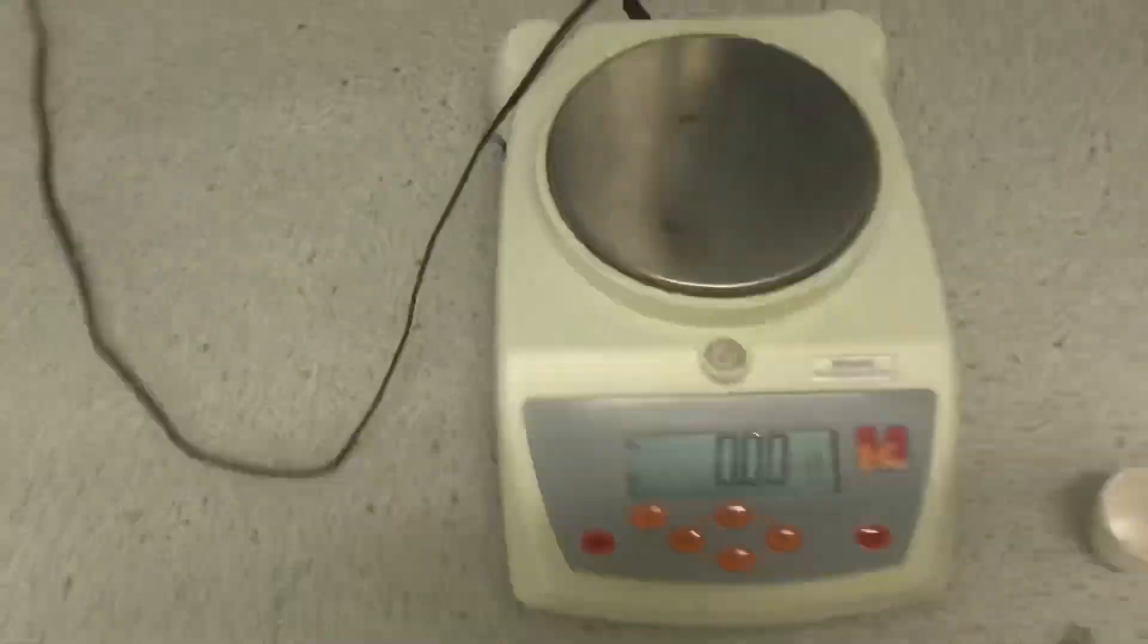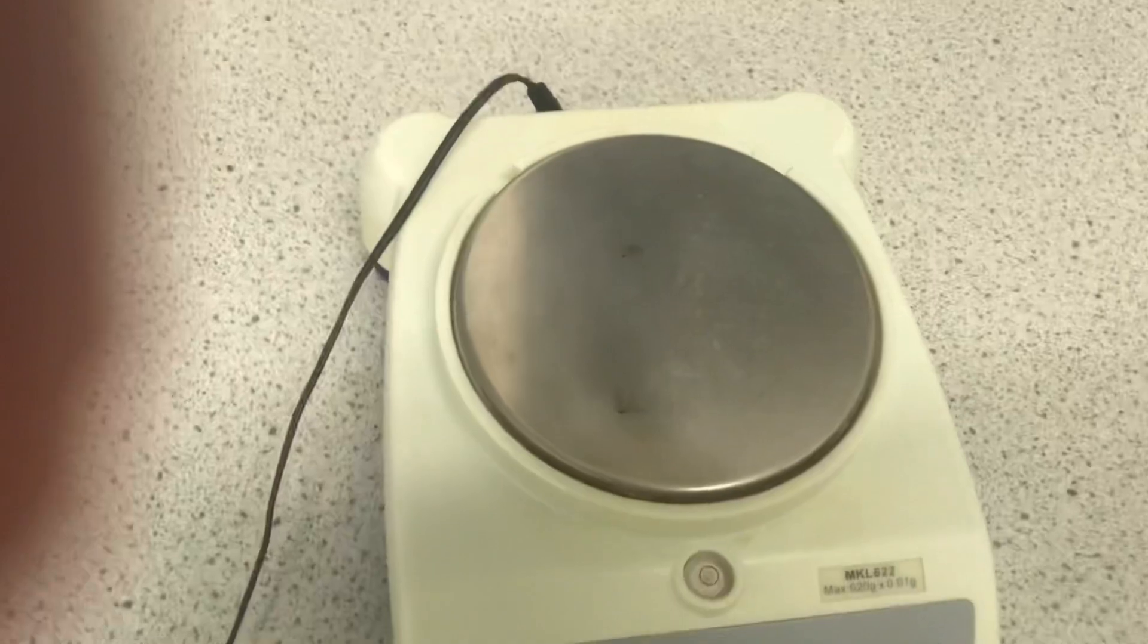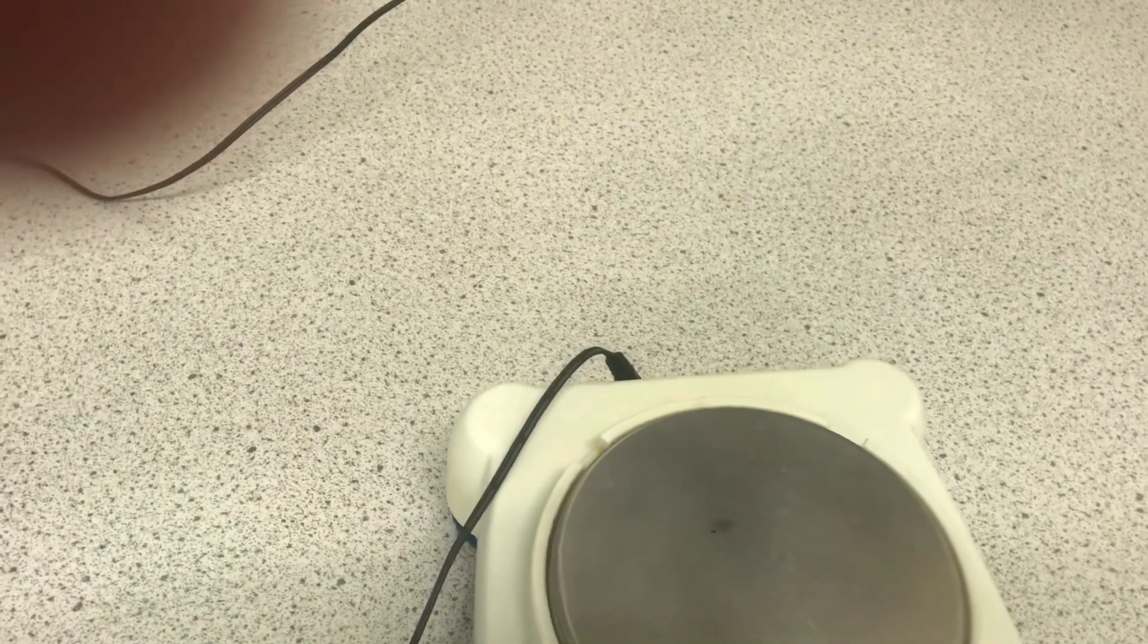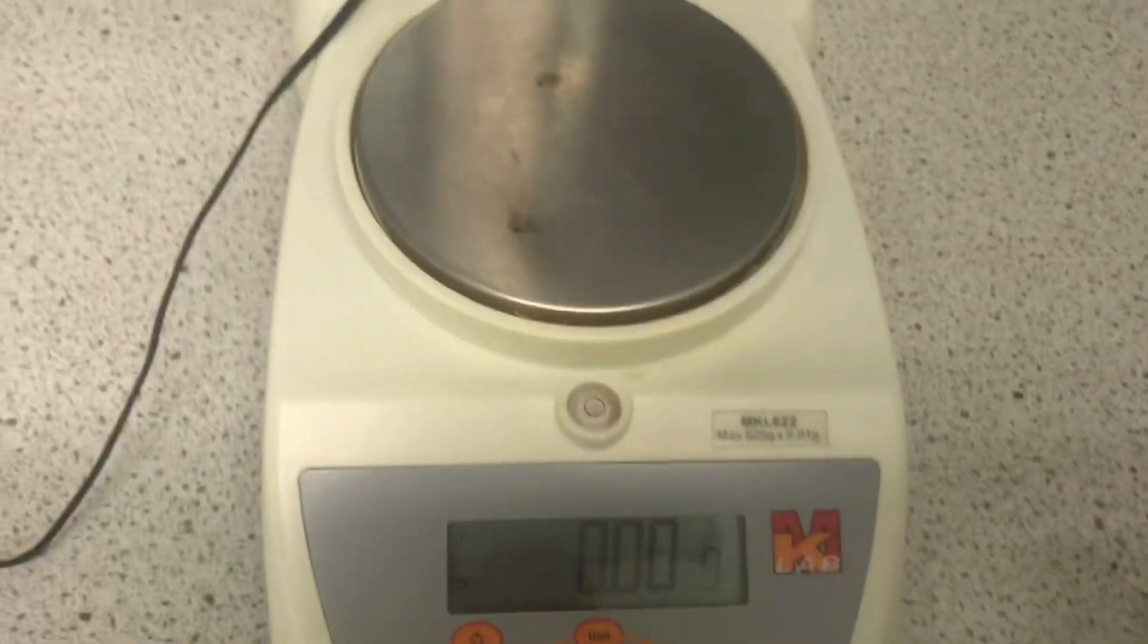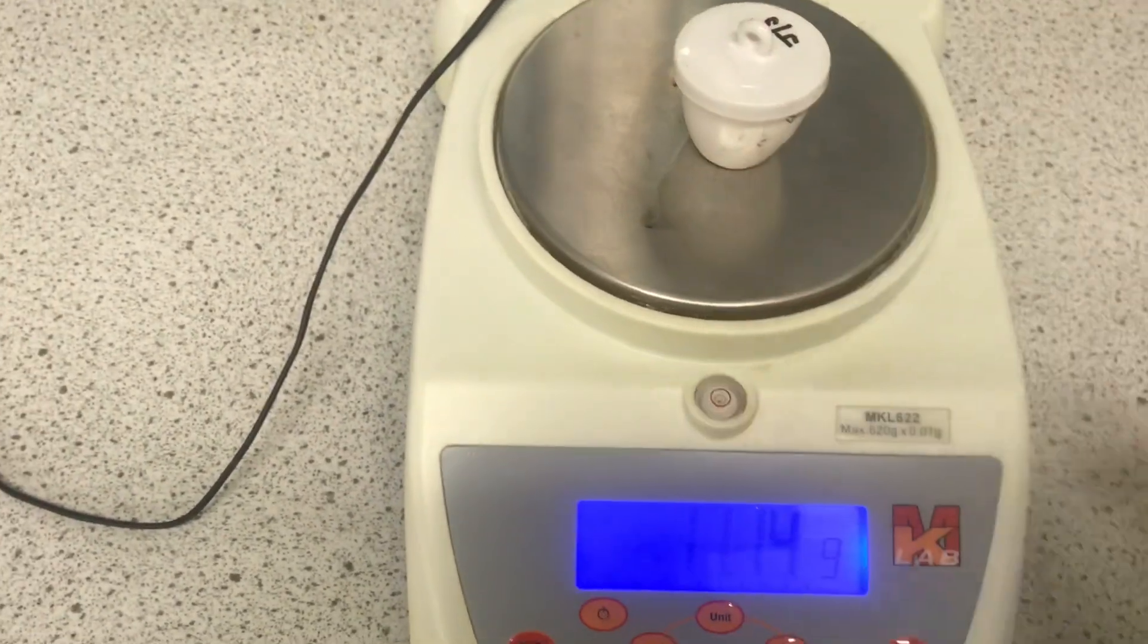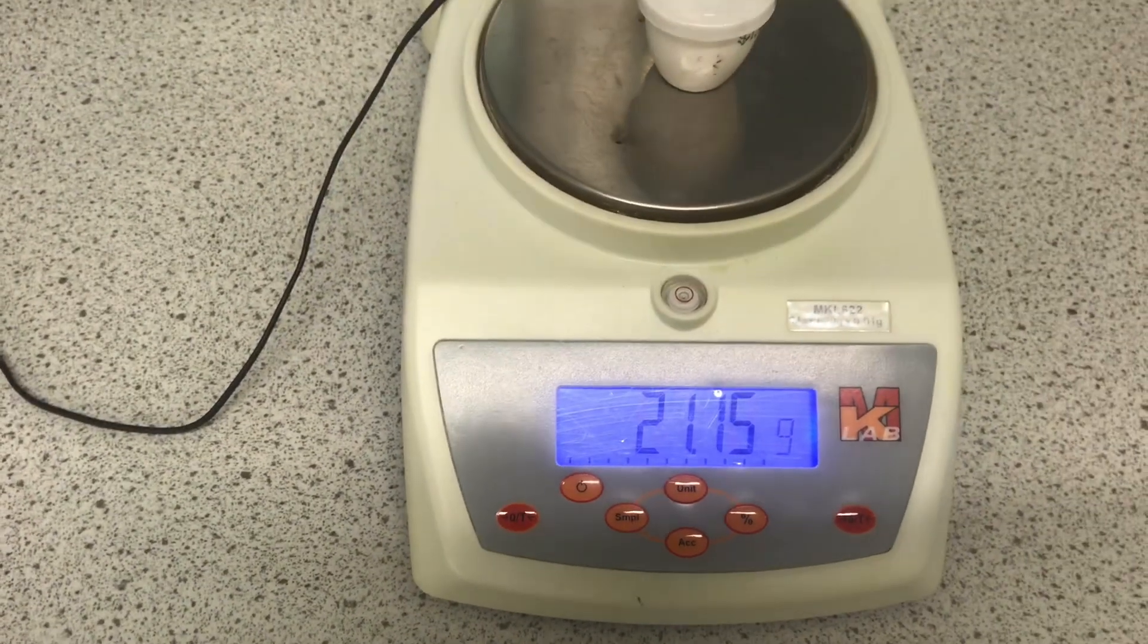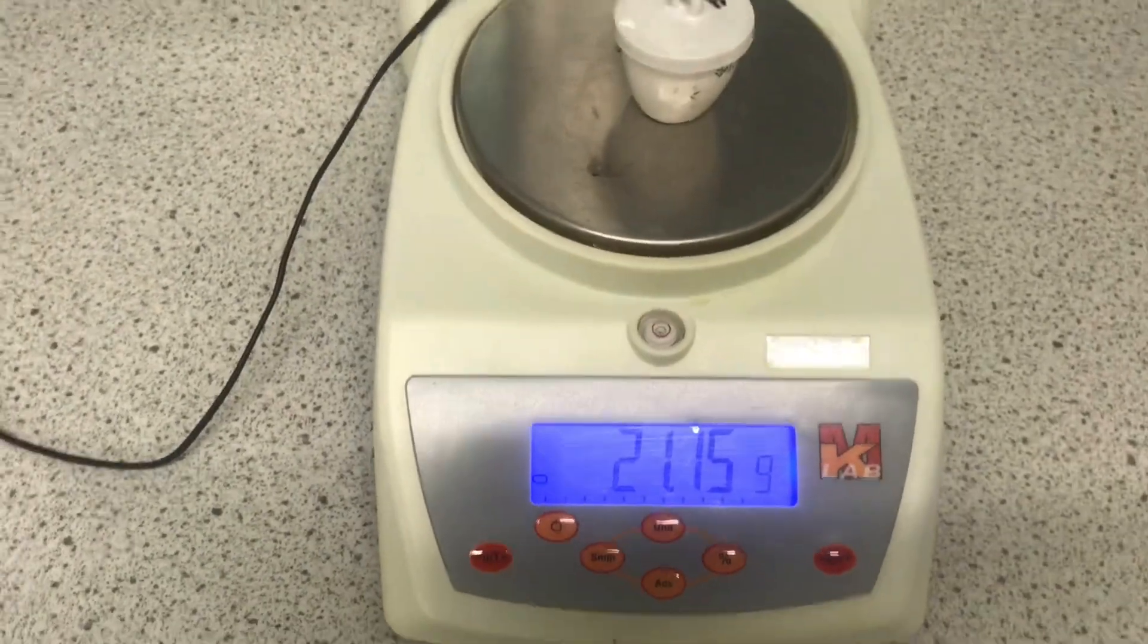My first step will be to determine the mass of my crucible along with the magnesium and its lid. So, I put the magnesium in my crucible, put the lid, now we'll place this on my scale to determine its mass. The mass is 21.15 grams.